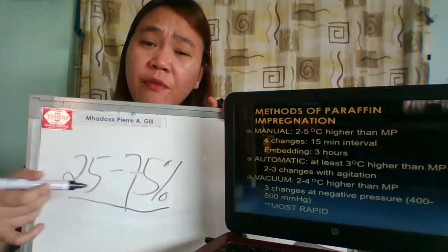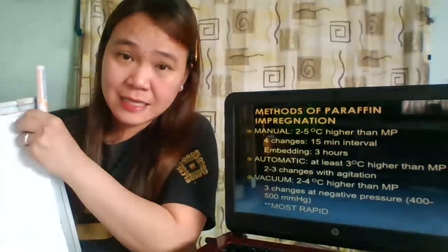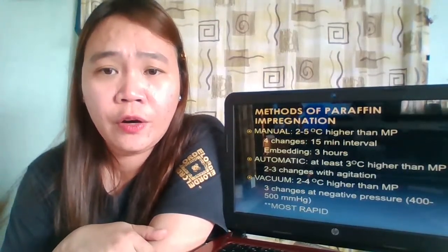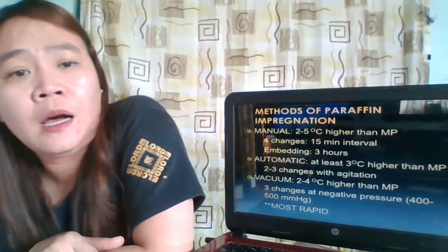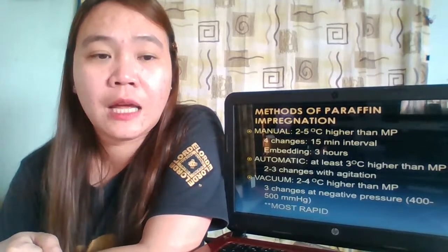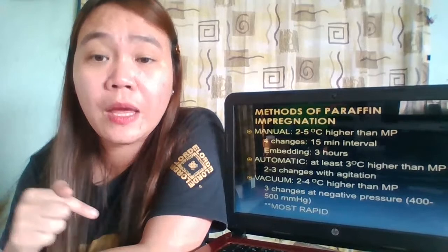So apart from reducing the time, another effect of this would be your tissue sample is not overexposed, or it is not exposed to heat for a long period of time as compared to when you perform automatic or manual processing. So I repeat, your tissue sample is not overexposed to heat. So the different effects of heat will be prevented.